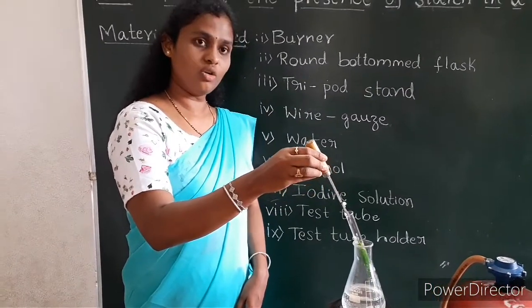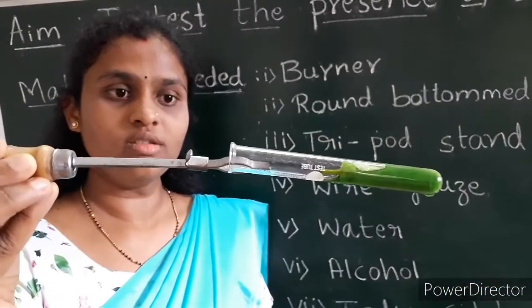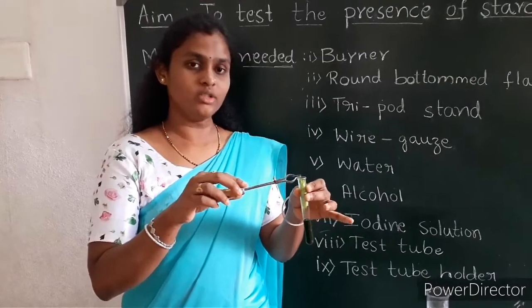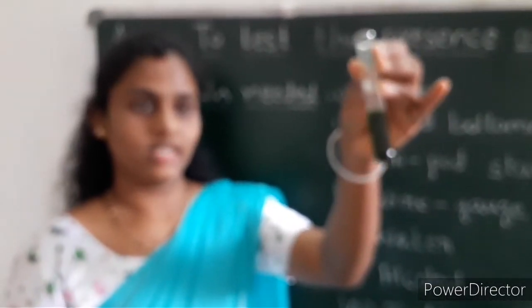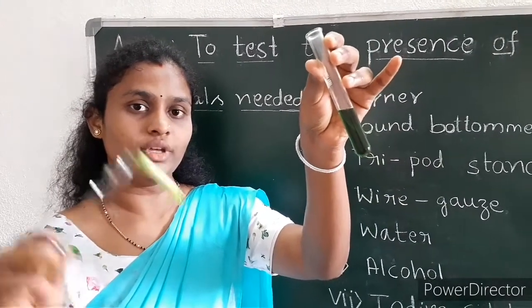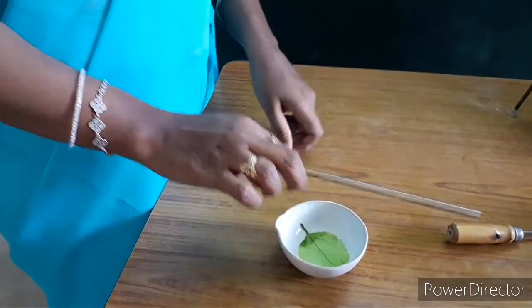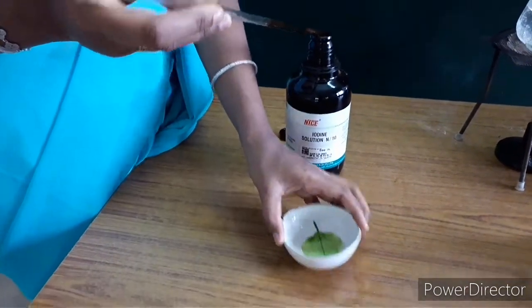Here, you can see that the alcohol has turned its color — it has turned to green. That is because whatever the chlorophyll is in the leaf, it has dissolved in alcohol. Let us take out the leaf from the test tube. Here, you can see the color has changed to green because the chlorophyll in the leaf has been dissolved in the alcohol. Now I will place this leaf into the porcelain dish and I will add iodine solution to this porcelain dish.